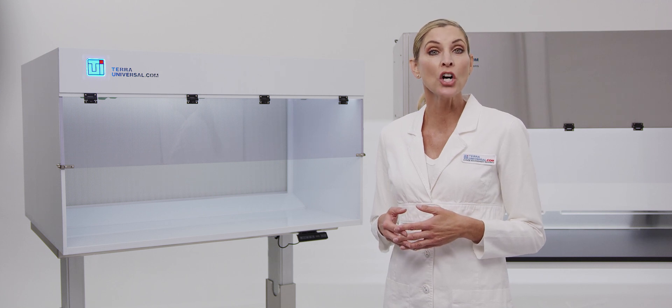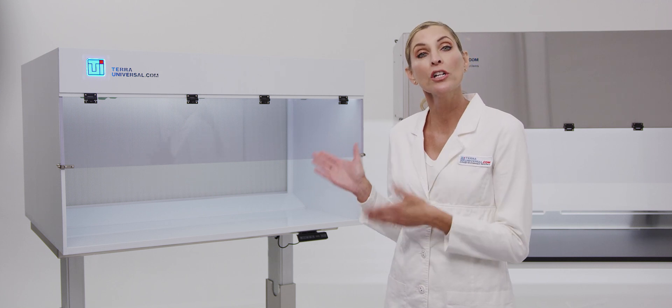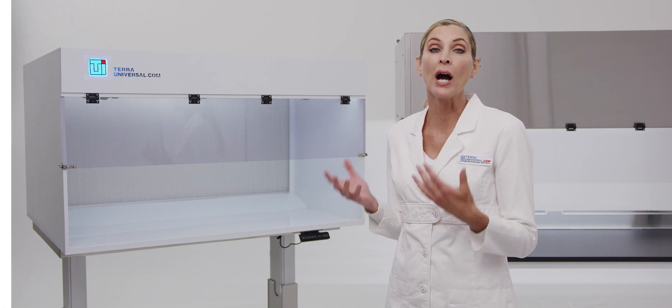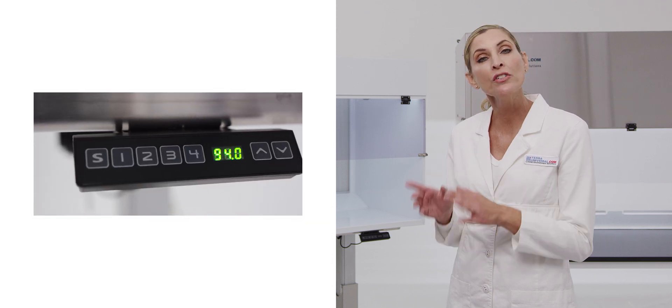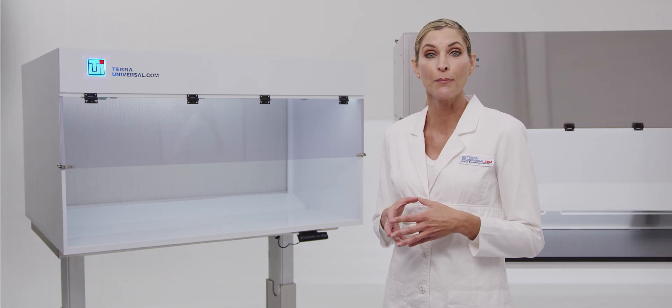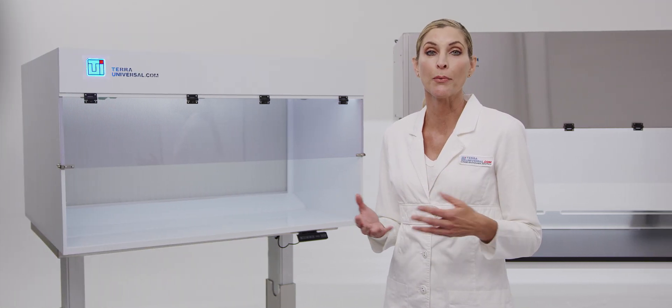This hood is installed on Tara's ErgoHeight ergonomic height-adjustable cleanroom workstation. Tara's ErgoHeight system electronically adjusts work surface height with the push of a button. The front keypad stores up to four height settings to accommodate standing and seated preferences for multiple operators.